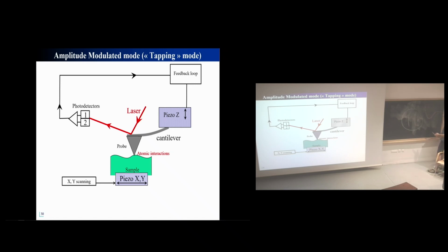So you see that there are two attractive forces for two different distances. So it's unstable. And there is a way to avoid this, but with very small oscillation amplitude. We can discuss that later on if you want, but it's another world, in fact.